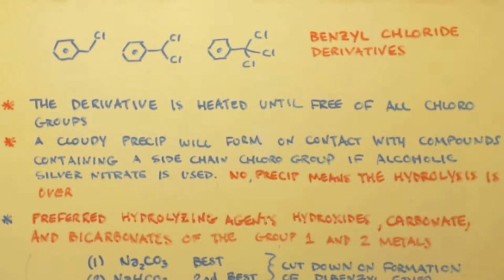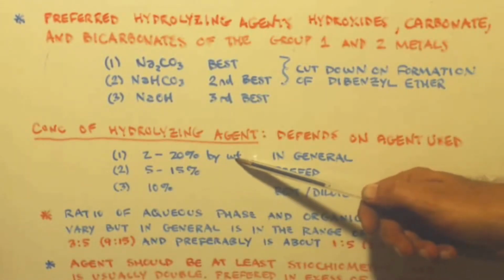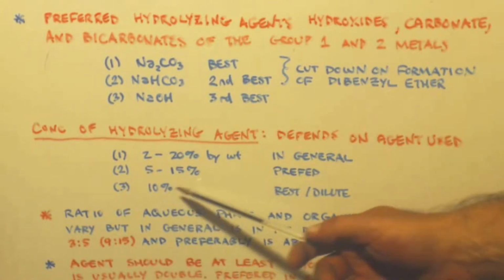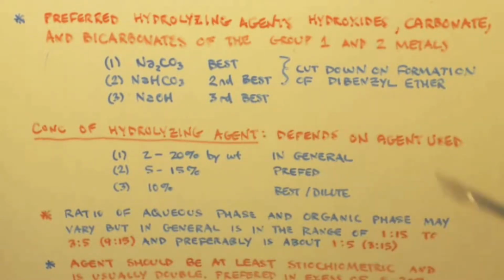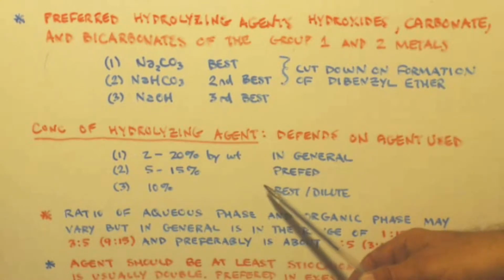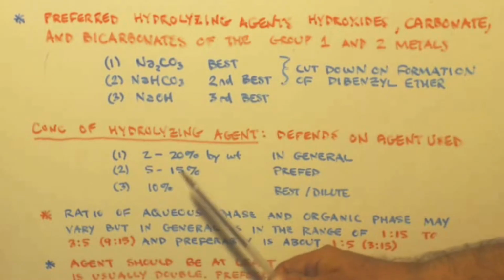What's the concentration of your hydrolyzing agent? Well, it depends on the agent you used, first of all. But in general, you can say 2 to 20% by weight. Preferred would be 5 to 15. And of course, the best would be 10%. And anytime you see something saying dilute, usually 9 out of 10 times, not 10 out of 10, dilute means 10%. 10 to 20%, but usually 10% is what dilute means. That would be the best. But again, it depends on the agent you use, but I'd go with 10%.